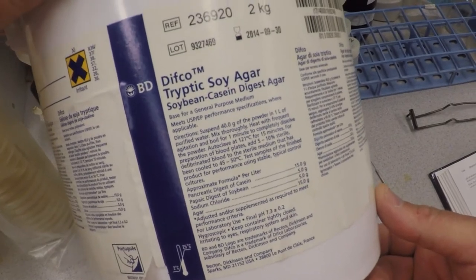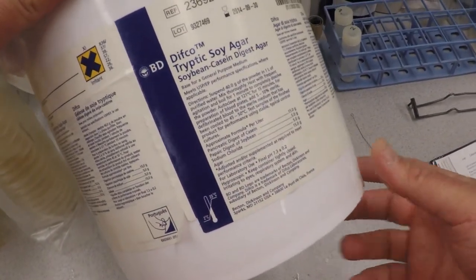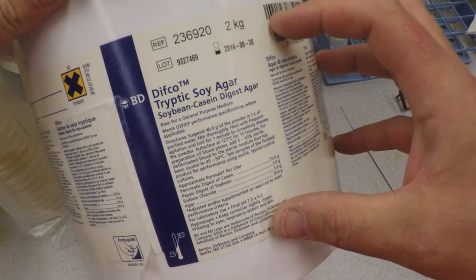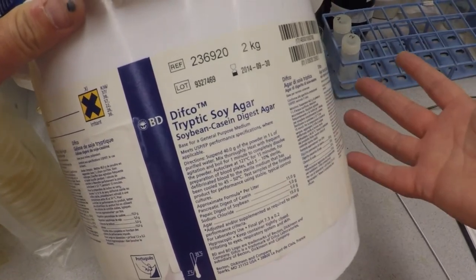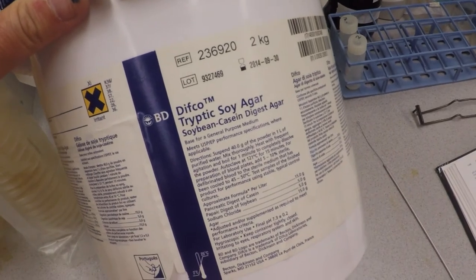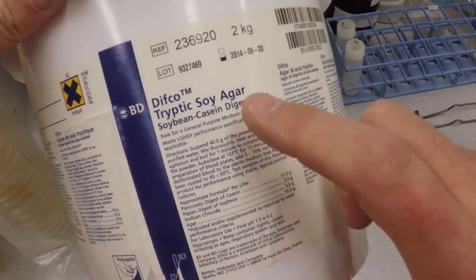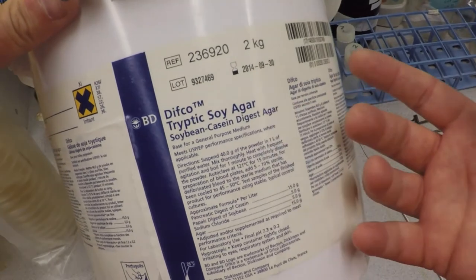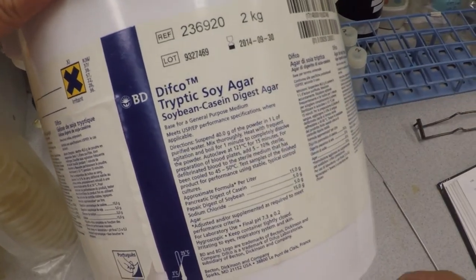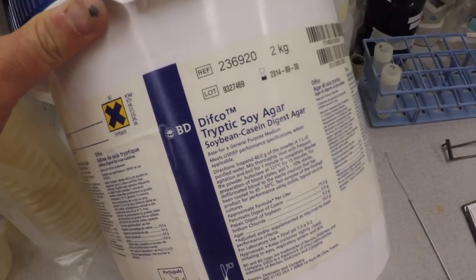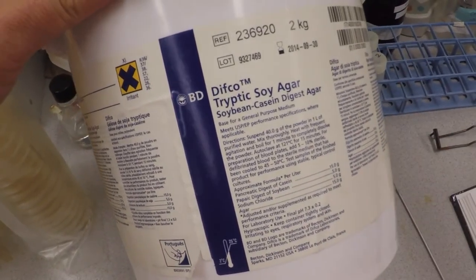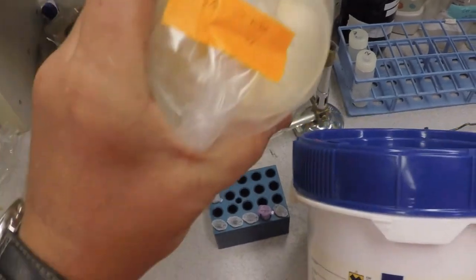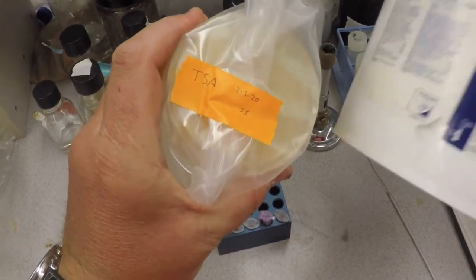This is a complex medium that somebody has made. Difco is the company. This stuff comes in a big vat. All you have to do is take this powder, follow the directions, add it to an Erlenmeyer flask with your water, sterilize it, and then you can pour your plates and use it. This already, because it says agar, has agar in it. If you see something else that says tryptic soy broth, that means there's no agar—you've got to add agar to it to make it solidify.